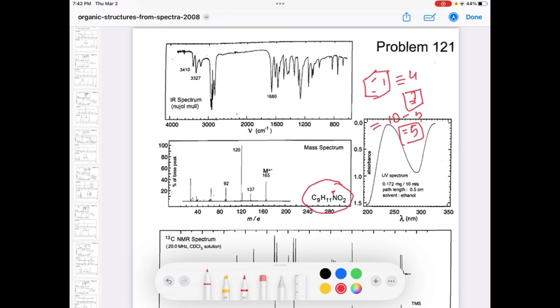And remember, you have 2 oxygen in your molecule. For 2 oxygen you can think it could be carboxylic acid, it could be ester. So what are the conditions to be carboxylic acid? You have to have a carbonyl peak in IR around 1700, along with an ugly broad band from 2500 to 3000. So here let's see in the IR.